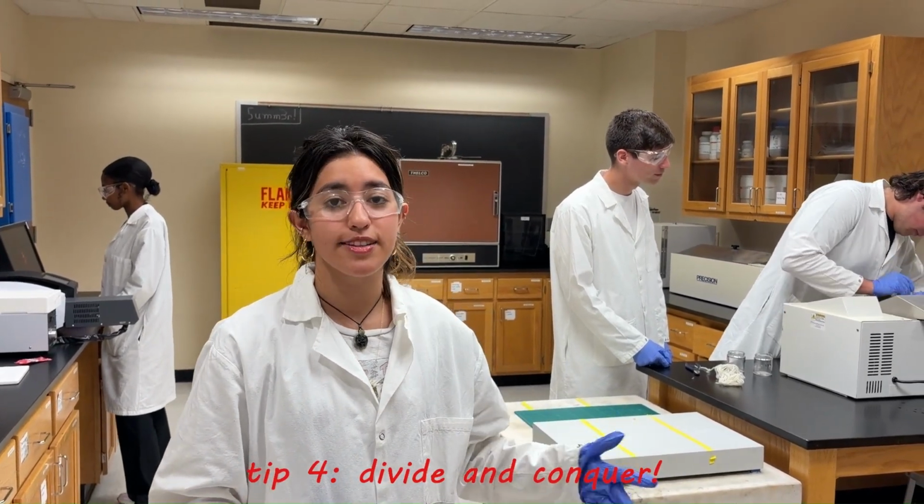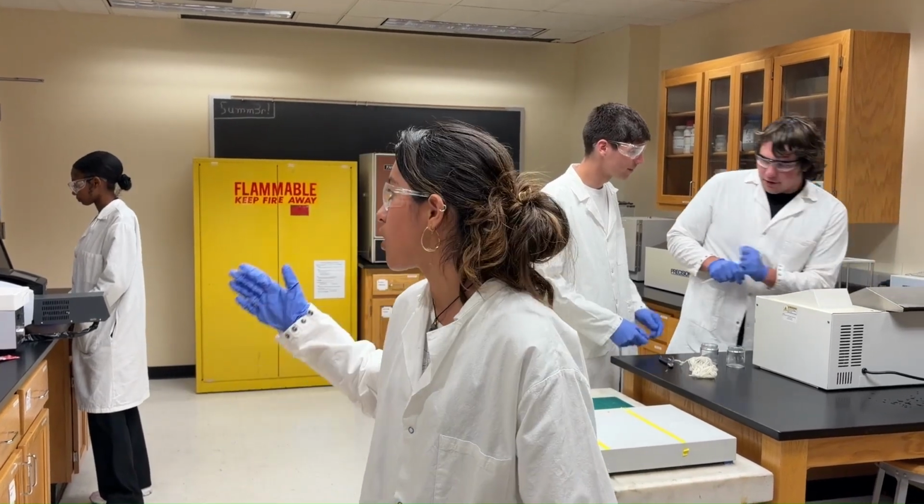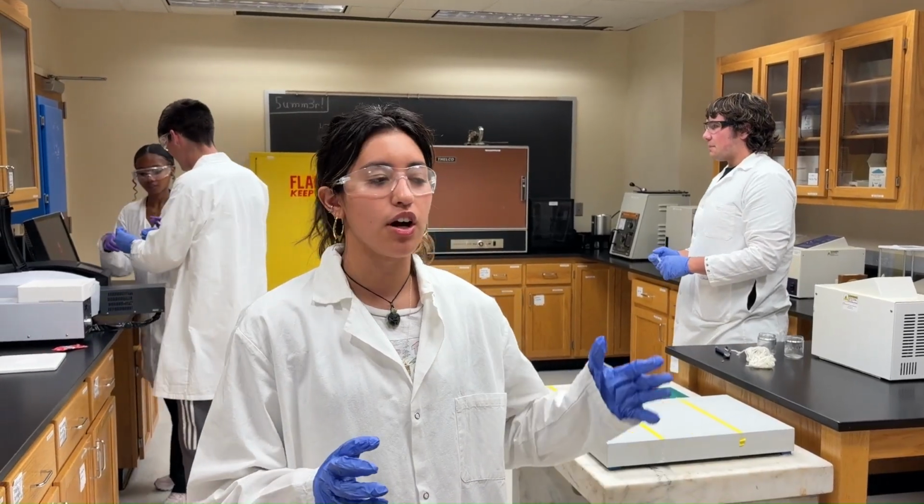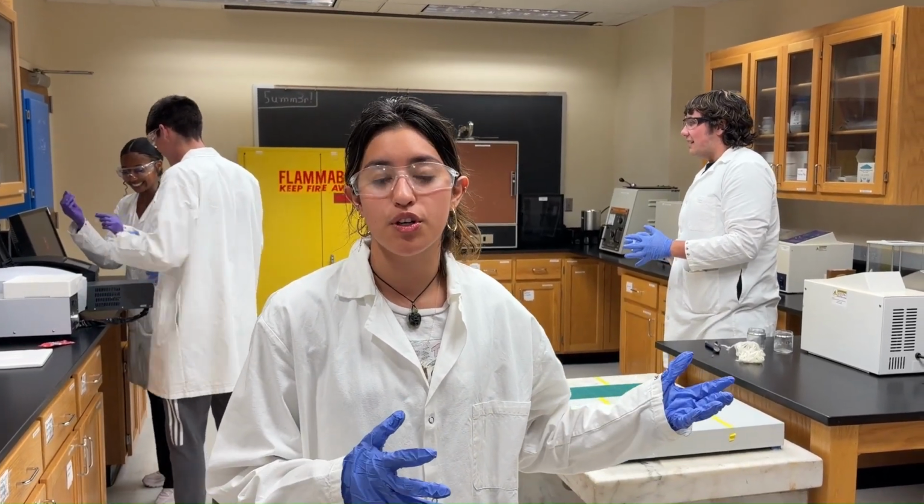For this lab, you're definitely going to want to divide and conquer. We have a lot of cuvettes, a lot of samples to take, and then a lot of UV-Vis scans to take. The suggestion is having multiple people working on different conditions or having one person work on each condition.